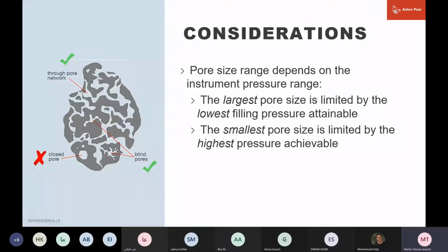Now, let's look at these small pores here on this uppermost surface. These are really small. So when the analysis starts, mercury will not penetrate into these pores. They connect with the surface of the solid, but they're too small at the starting pressures. So they will not intrude until much higher pressure. But let's follow where this pore network goes.